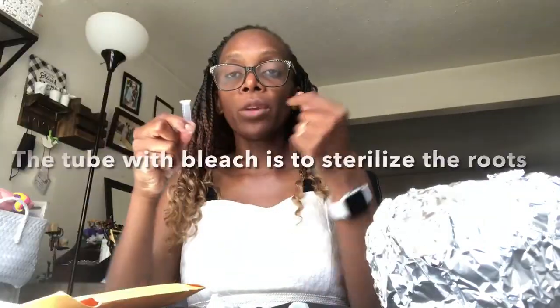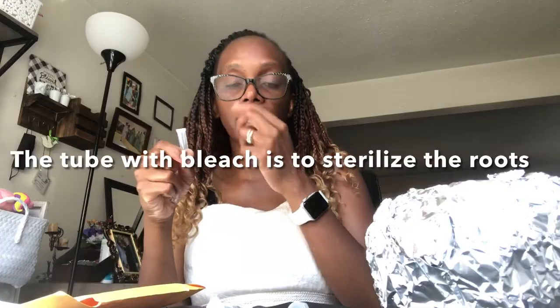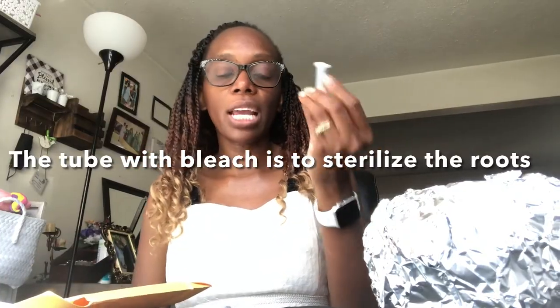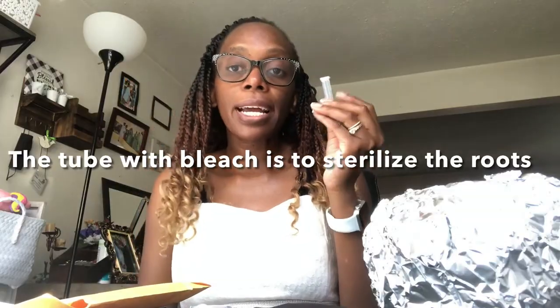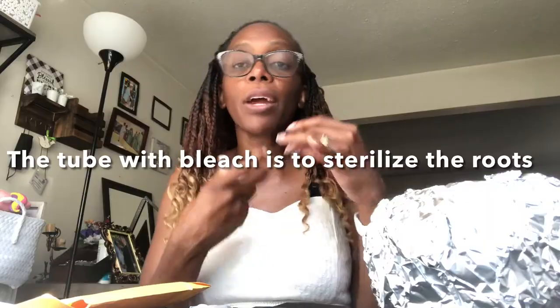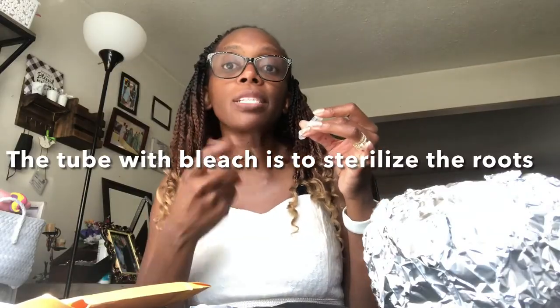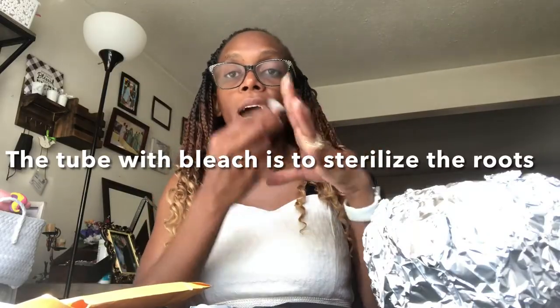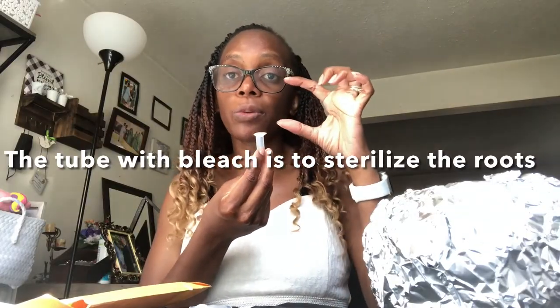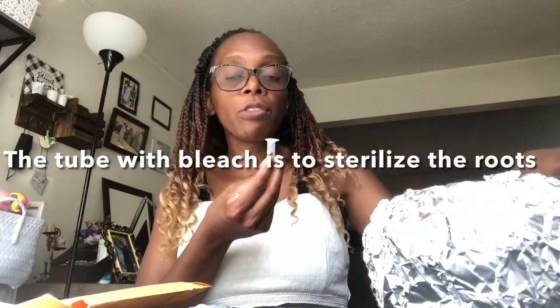And why do we crush that root segment? Okay, so first of all, why do we have to sterilize? We have to sterilize because we want to get rid of any other microorganisms that might be around or outside our little root segment that we're going to cut off. Because remember that this is coming from the soil.